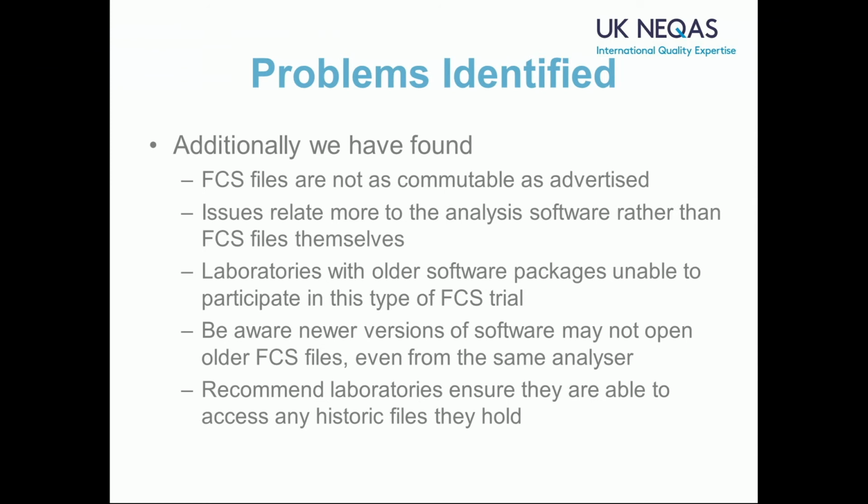And we found, I think it was over these exercises, that between 5 and 10% of the laboratories participating couldn't open the files, try as they might, because of the software differences. And try as we might, because we could only create FCS files using the latest versions of the software packages.